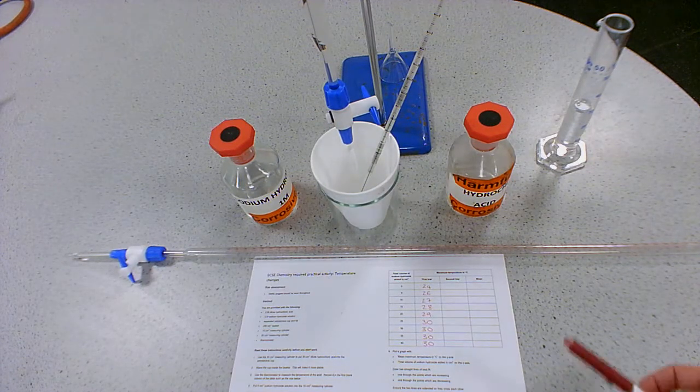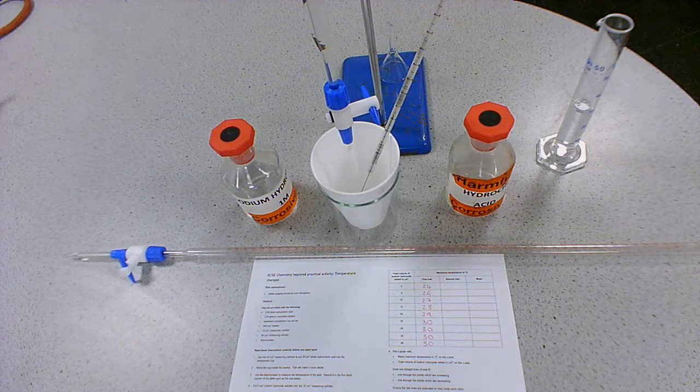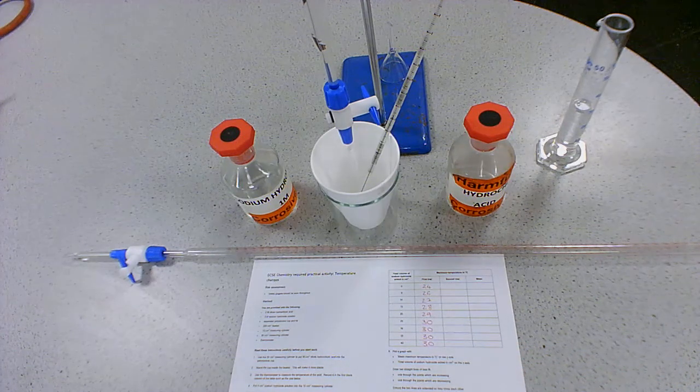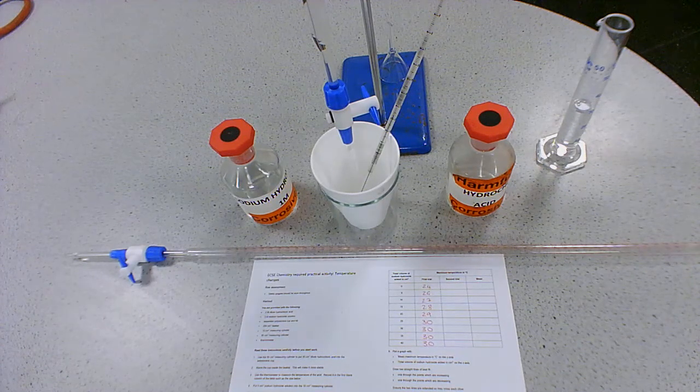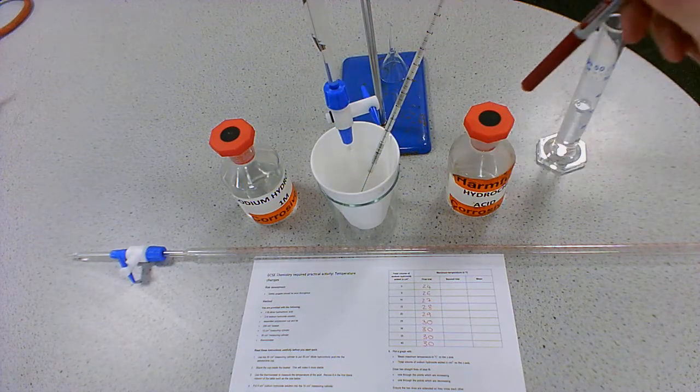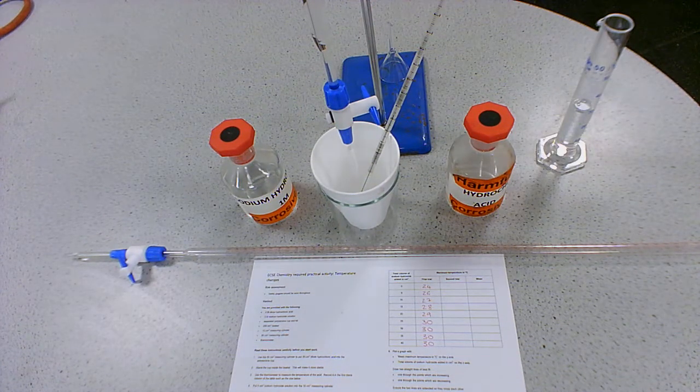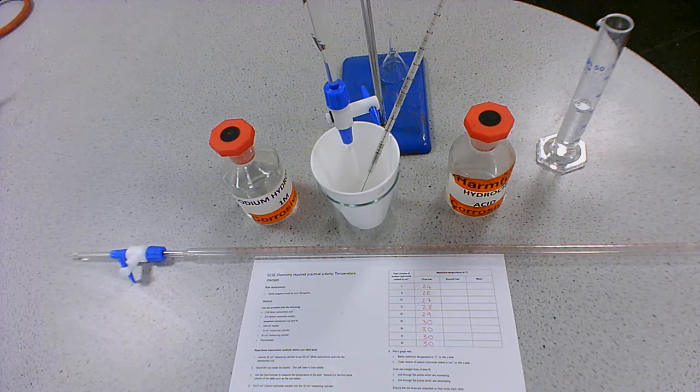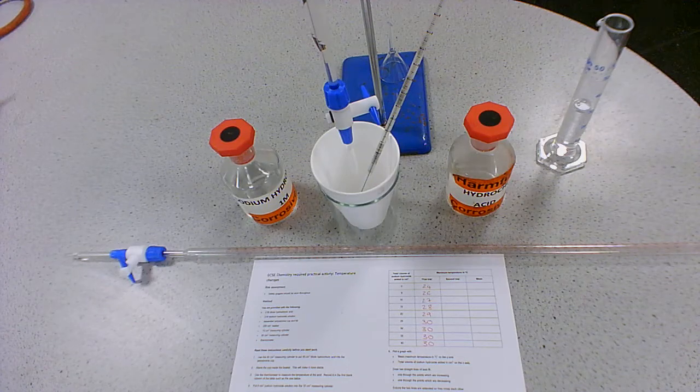So what we're going to be doing is reacting hydrochloric acid and sodium hydroxide. And what we're going to do is we're going to use the temperature changes of the reaction in order to determine how much sodium hydroxide is needed to neutralize hydrochloric acid. So we'd be able to determine the end point of the reaction by finding the peak temperature change.